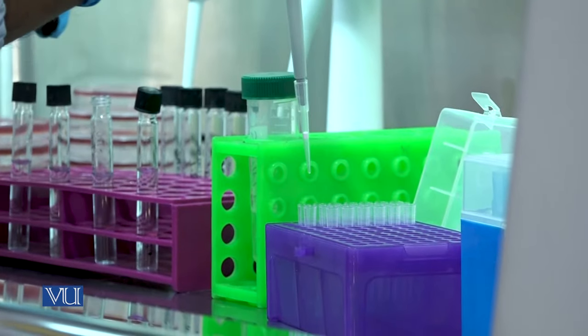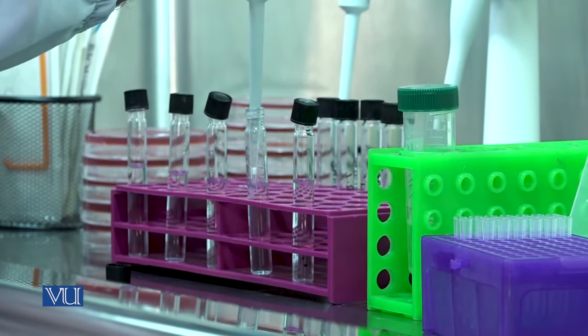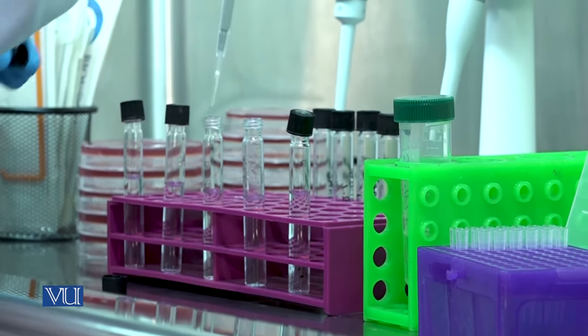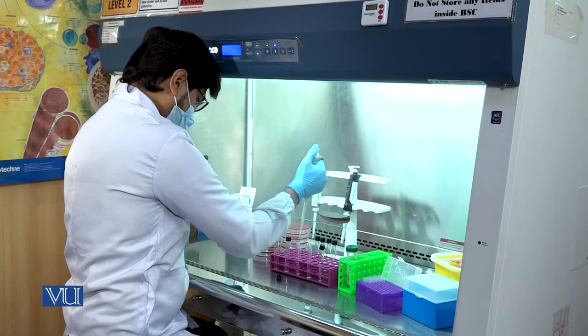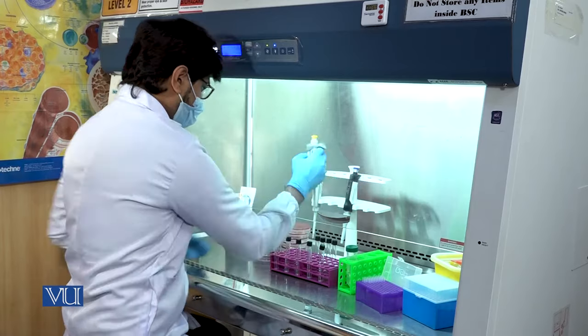For making third dilution, one milliliter solution is picked from second dilution and added to the third glass tube. Discard the pipette tip and close the glass tube with the cap and mix the contents.